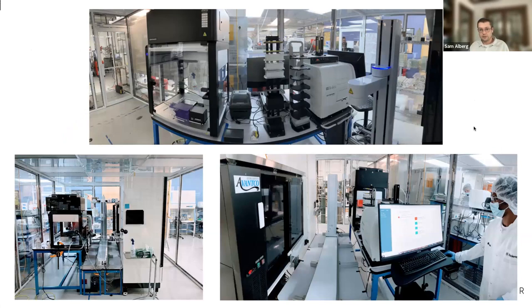Here are a few images of this system, starting with the top image. This is one half of the work cell deck. You'll see the Opentrons with the HEPA filter on top of it. That's where we do all of the liquid handling and the processing of these cells. We have some media hotels to just store reagents, and then the microscope there on the right. The whole system is connected together by a robotic arm on a rail. And if you look in the bottom left photo here, the right side of that rail, we have a media fridge and the incubator.